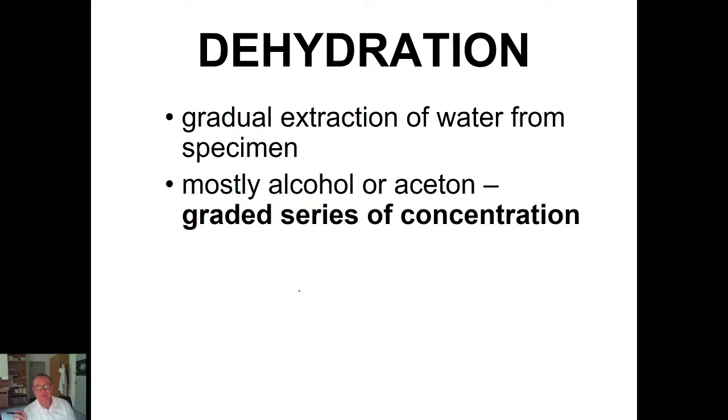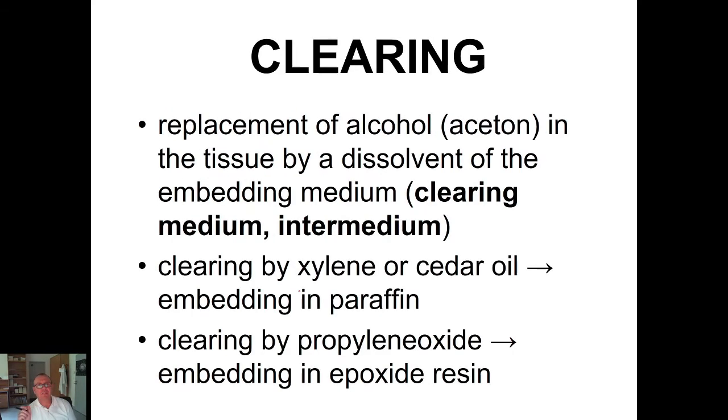But it's not everything, because the paraffin or epoxy resins or other embedding media are not soluble in alcohol or acetone as well. So the replacement of water by alcohol or acetone doesn't solve the problem.